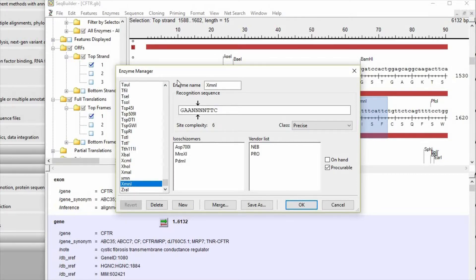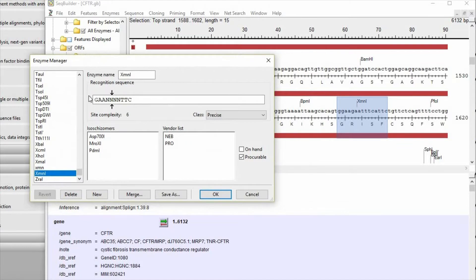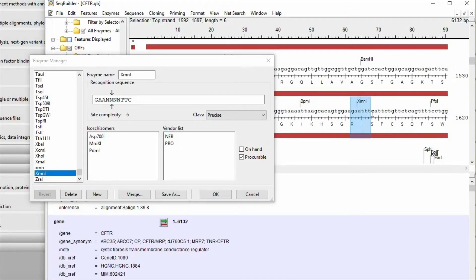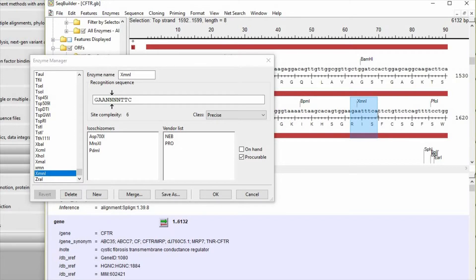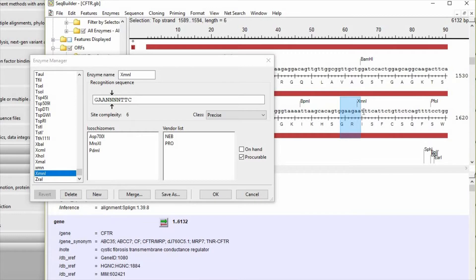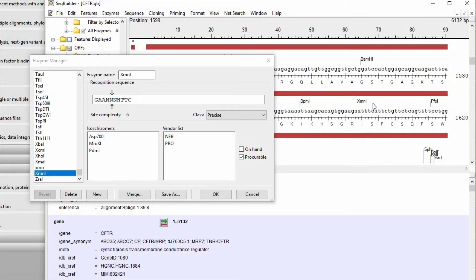We go to the enzyme manager, and we see that it looks for a GAA, and then four of any nucleotides, followed by TTC. So let's look at the pattern adjacent to this serine 489 position. We see this GAA pattern, but there's not an appropriate sequence at the end. But we happen to notice that just upstream of that is another GAA. So let's see if maybe that is a better pattern. So it goes GAA, and then GAAT, which are the four of any, and then TTC. So indeed that is the target site for the XMN1 enzyme.